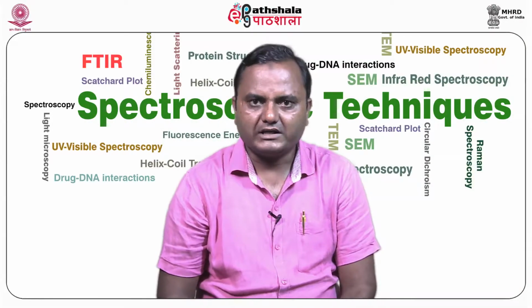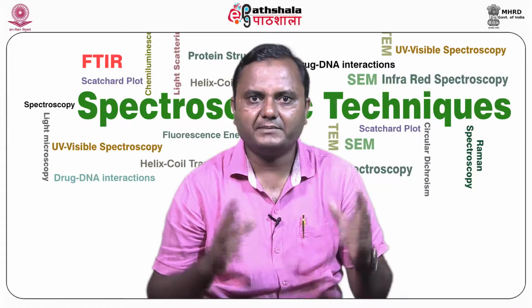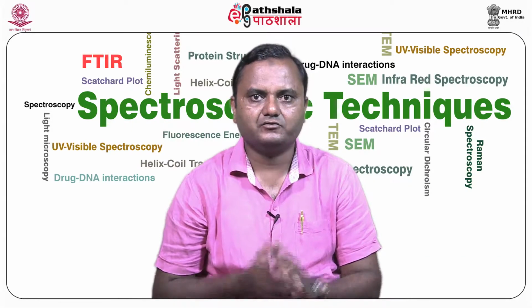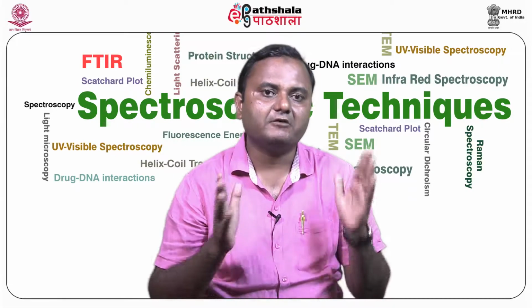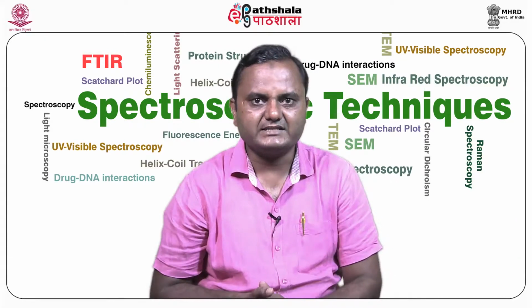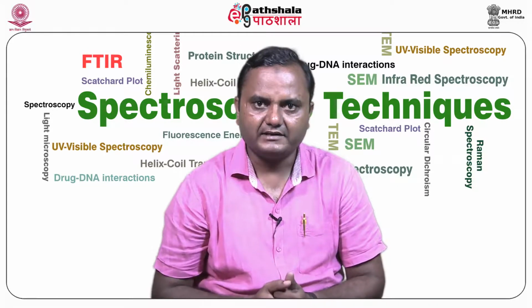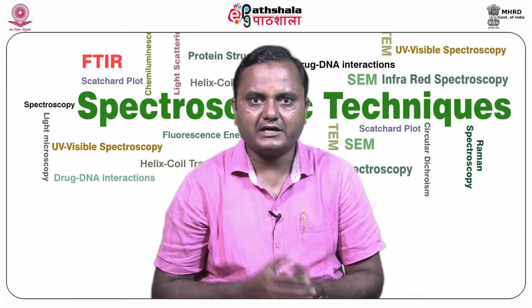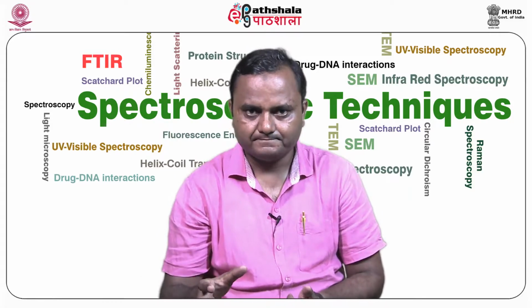Since we are talking about the angle of the scattering light, angular dependency is a very important factor. At high molecular size, the intensity of light scattered will start to vary with the measurement angle, and we must account for this phenomenon. This is called angular dependence. Isotropic scatterers are small, with an Rg value less than 15 nanometers, and have little or no angular dependence in the intensity of light they scatter. However, anisotropic scatterers are larger particles with Rg value more than 15 nanometers, and the intensity of the light scattered varies with the angle.